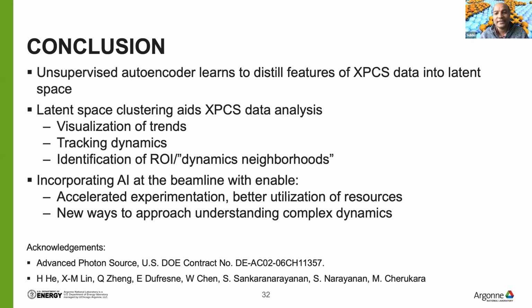And how general do you think, Jay, is this? The techniques seem fairly general in terms of applying it to other classes of problems. Any comments on that? So we haven't actually tested on any data other than just this colloidal suspension, but I think that you're right. The technique should be pretty general. It's all just going to be about retraining with applicable XPCS data, because the dynamics are going to be completely different system to system.